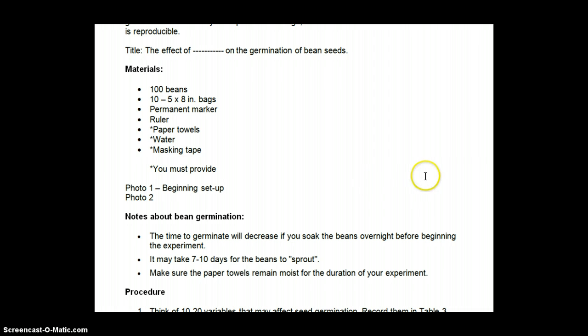All 6 bags in a row. They're all labeled with what variable they are and whether they're the experimental or the control bag. And in front of that, put a piece of paper that has your name on it and the date that you're doing this setup. And then after 7 days or 10 days, if nothing happens after 7, then you do the same thing.